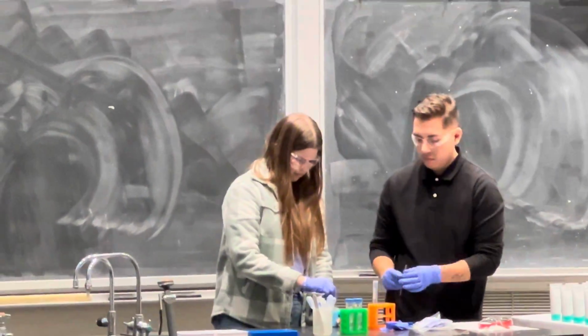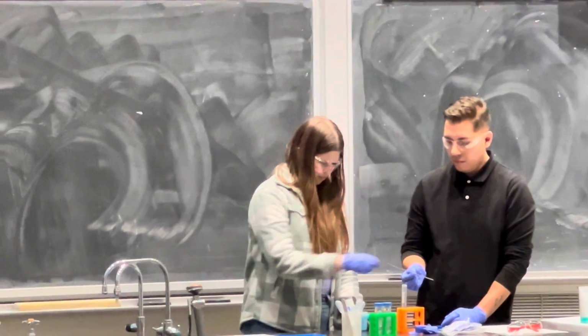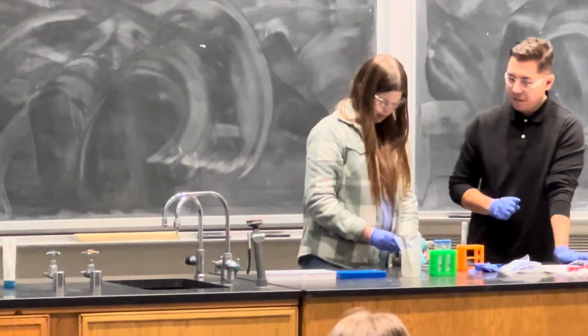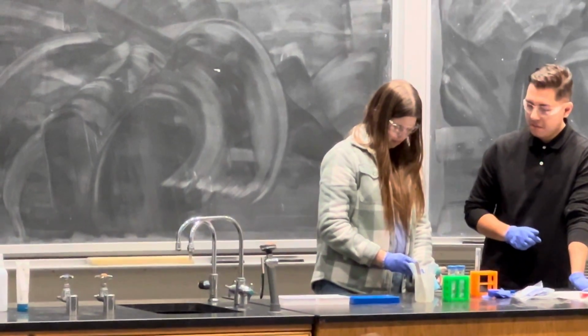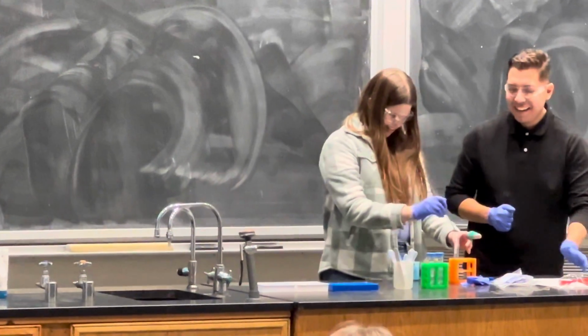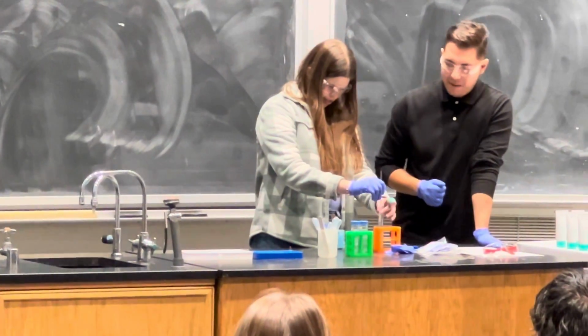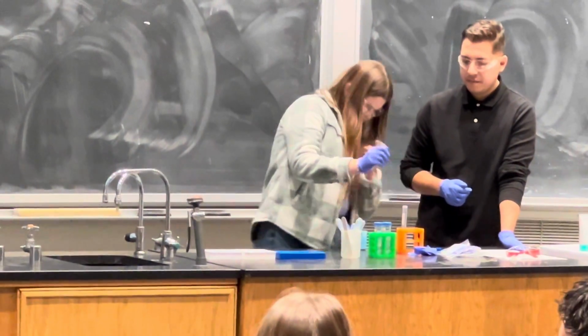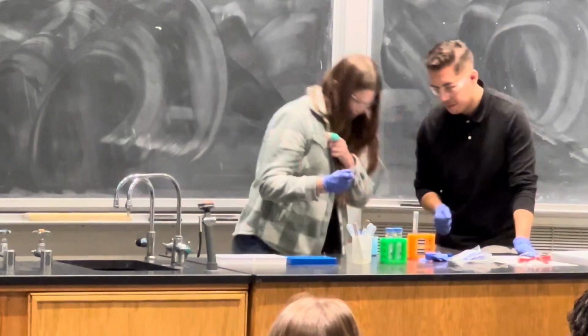It would be 100 milligrams in a centrifuge tube. So it'll be just a little scoop. Estimate how much 100 milligrams you can. Actually, I don't know. Yeah, it'll just be a little scoop. Just get at the bottom. Good. Yeah.